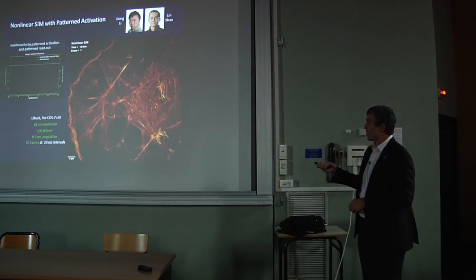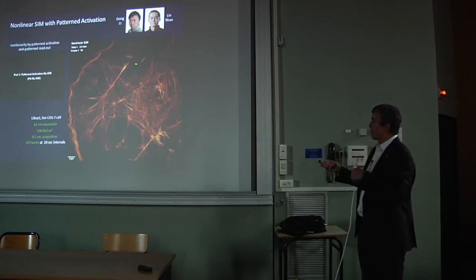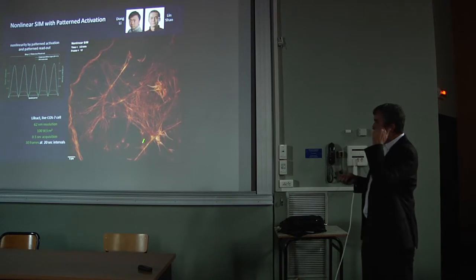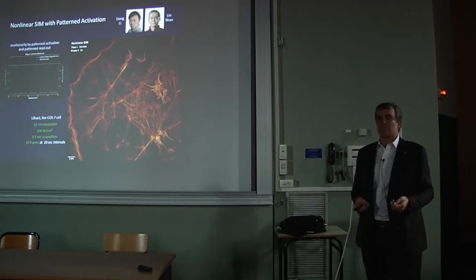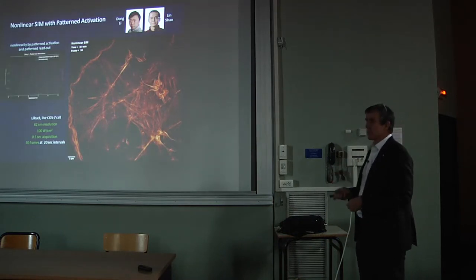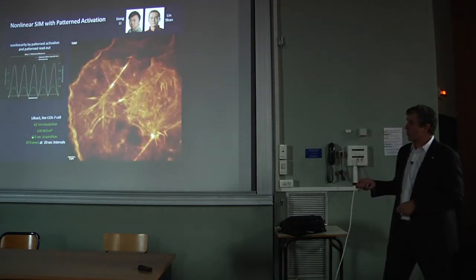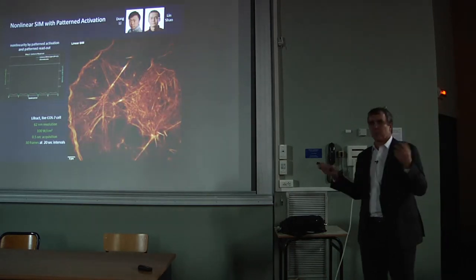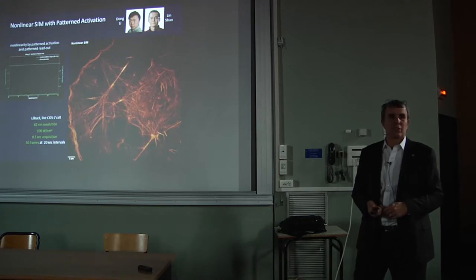And so as this movie's been playing back and forth, you can see as we go from diffraction limited to linear SIM and nonlinear SIM, the gains in resolution. Once we do that, we can take images as fast as 1/3 of a second. This is 1/2 a second here. And we can take anywhere from 1 to 3 or 4 dozen images.